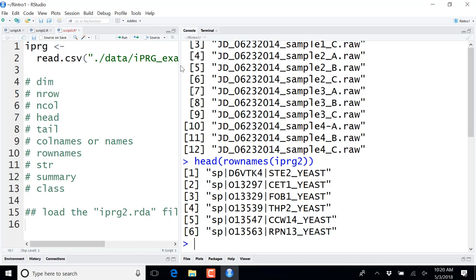So it's a different representation of the same data, except that here I focus on proteins by samples, and in the other case I have 7 variables: proteins, samples, intensities, biological replicates, technical replicates, and for each line I have these 7 pieces of information. Okay? So we have different ways to format, to structure the data. And there is no better format, depending on what we want to do. Some are better than others.